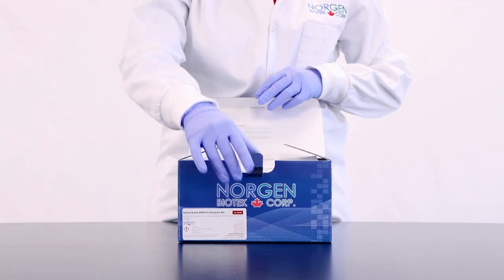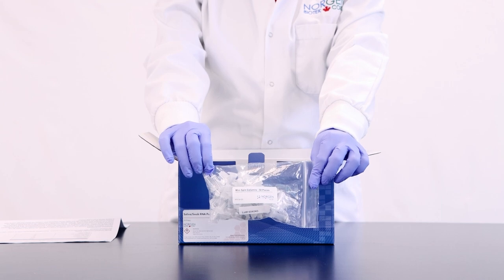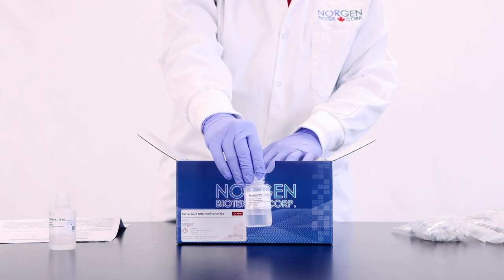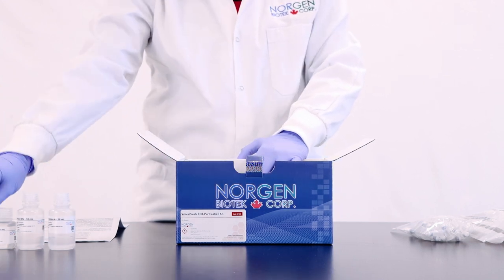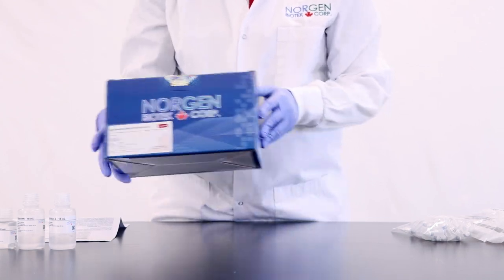Upon opening the kit, you will find a detailed product insert, mini spin columns, collection tubes, elution tubes, wash solution A, solution WN, lysis buffer A, and elution solution A. You as the user will need to provide 1xPBS, pH 7.4, and 96 to 100% ethanol.